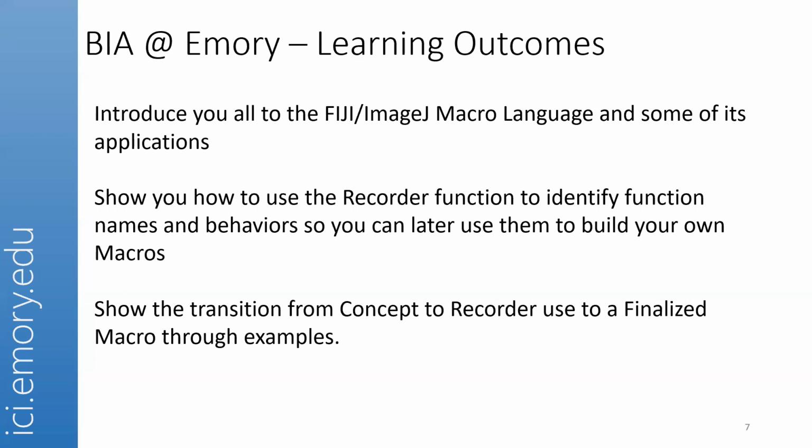So that tool, specifically the recorder tool, provides a lot of insight into how Fiji is doing things, and then it'll make creating macros for analysis much easier. And I want to take you just from the start of the development of a macro to kind of an end.